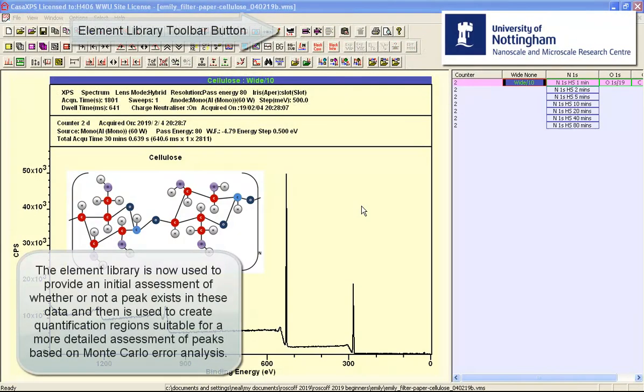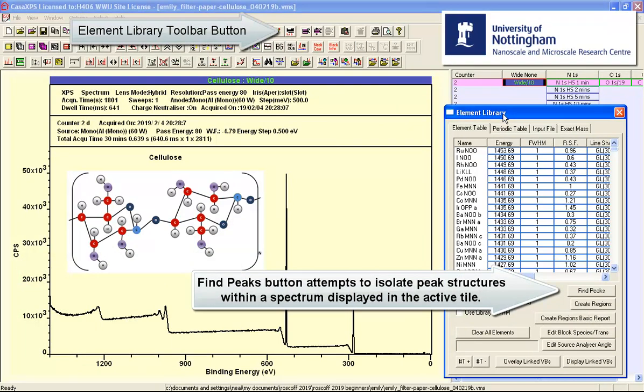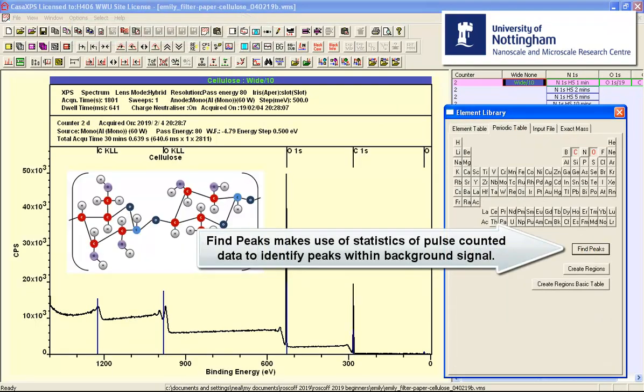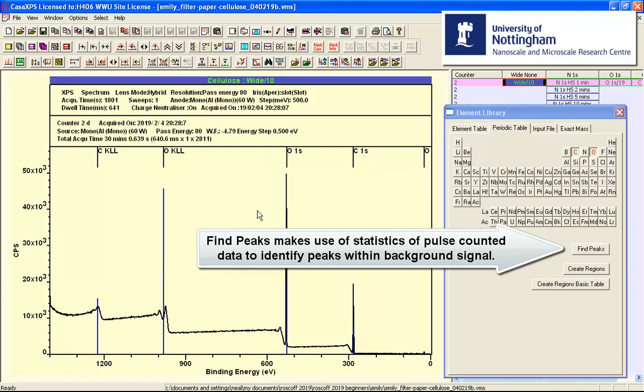One way to investigate whether we can actually identify nitrogen is to use the element library. The element library can be used to search for peaks.